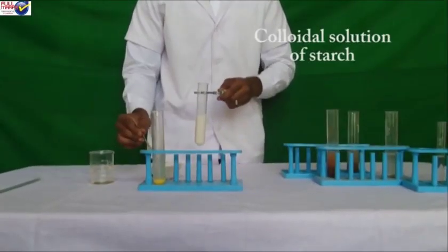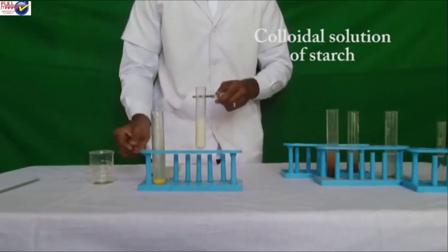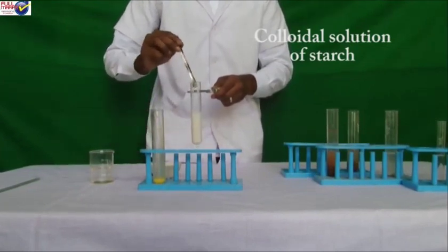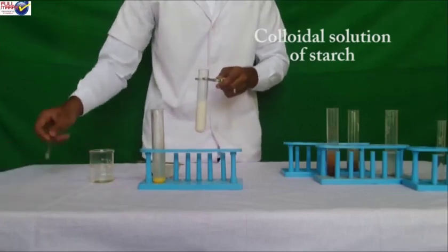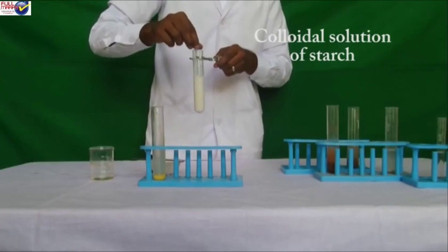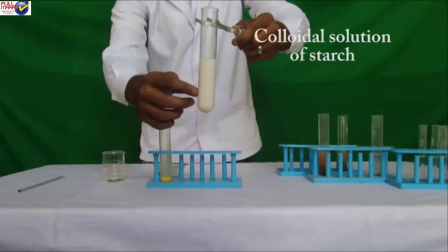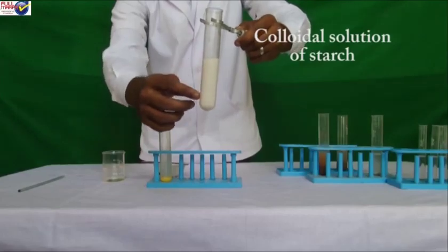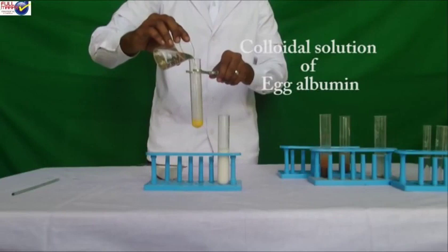C. To prepare colloidal solution of starch and egg albumin in water. Colloidal solution of starch in water. Now take 5 to 10 ml of hot boiling water and pour the contents in the boiling water. Allow the contents to cool. Record your observation.